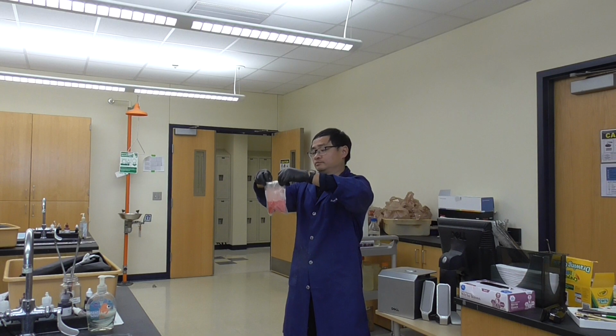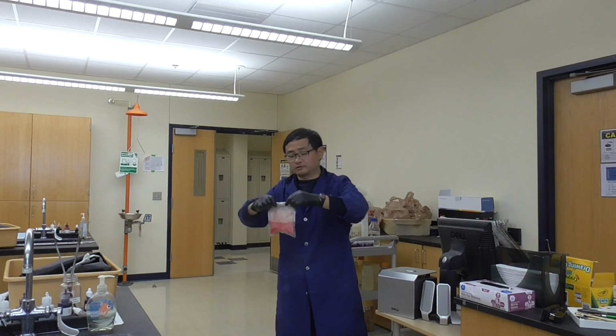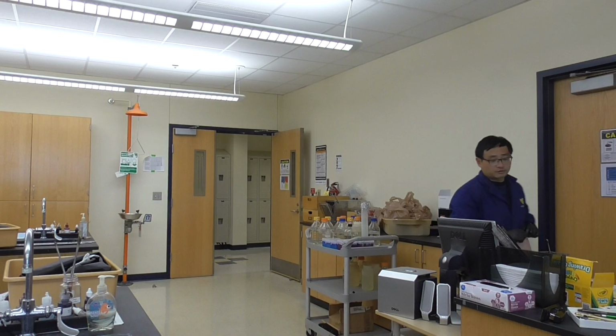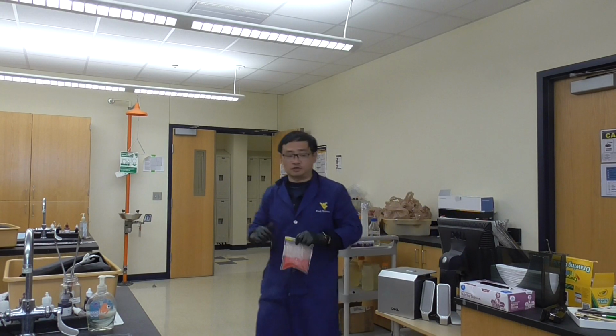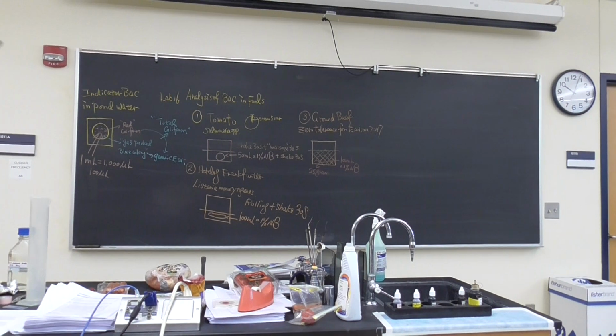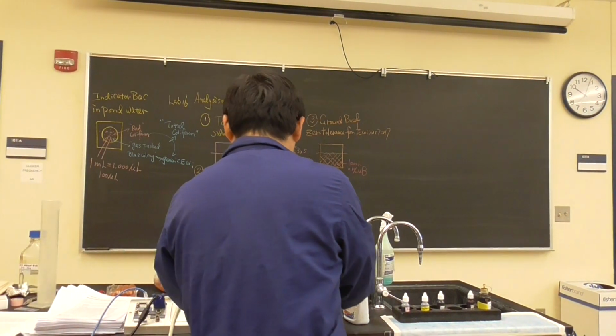Deoxymyoglobin, myoglobin, metmyoglobin, we talk about it. So that's for the ground beef. It's very interesting how we sample the ground beef. The different products is all the difference. Okay, so that's what I prepare here. You guys can use it.